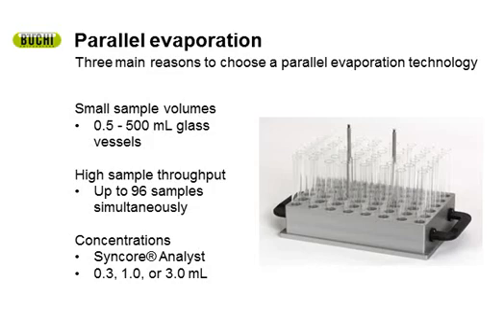Also, like I mentioned earlier, if you're concentrating small sample volumes, then go with the parallel evaporation unit, specifically the Syncor Analyst. It'll allow you to concentrate to a residual volume of 0.3, 1, or 3 milliliters.